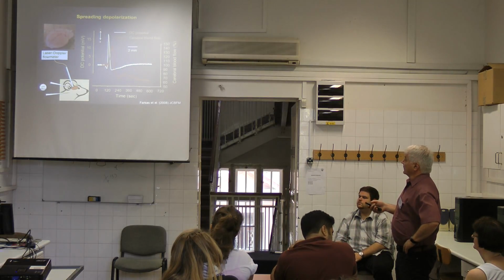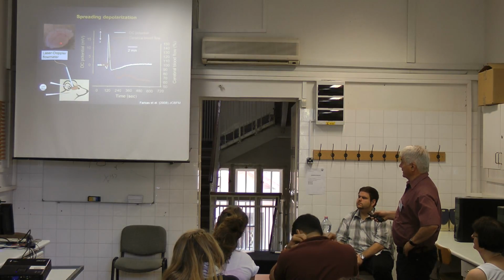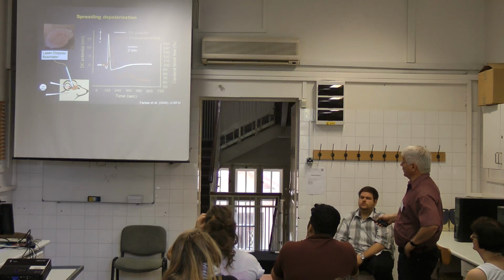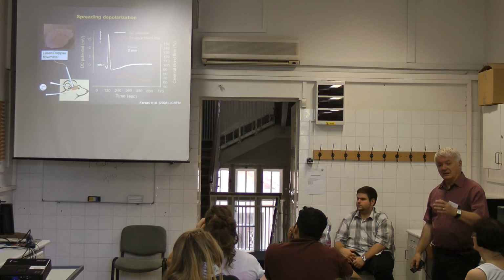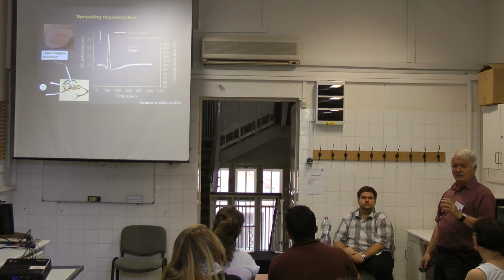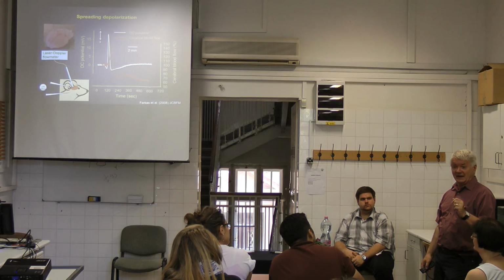So we try to do optical methods to study the brain. This is a laser flow meter. And also we check how we can visualize not only blood flow changes, but also the electrical changes. I mentioned that people are funny. They are using dyes for everything, even now. For example, some people are developing so-called voltage-sensitive dyes.